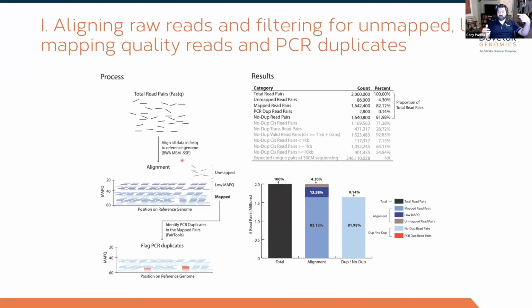You start reading at the 5' end until you hit either that chimeric event or it starts reading the oligo bridge, and then it clips that alignment at the 5' end, and then goes and starts reading from the second pair at the 3' end until it sees the chimeric event or the oligo bridge, and then it cuts the alignment and merges those two back together at the end.